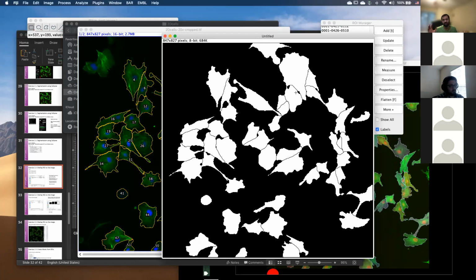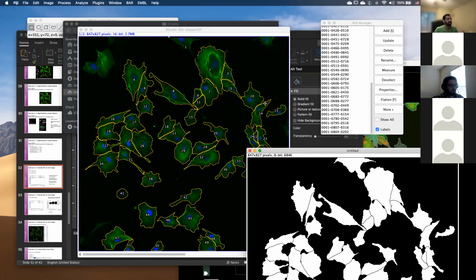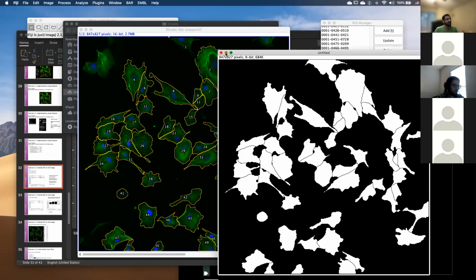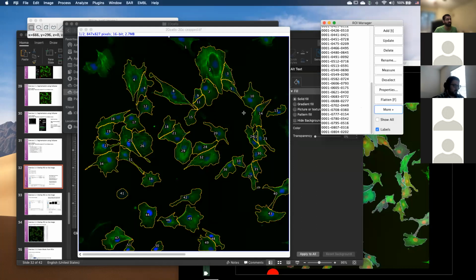And it's okay if you haven't saved, I'll provide you with files with proper names for the next Cellpose session. But the point is, we want to automate something that is generated from deep learning models, the mask which we generate from deep learning models.